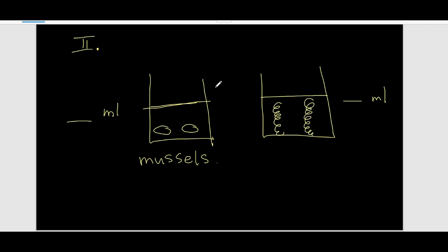Okay. So what we created is an artificial water system. It can be a pond or lake, or it can be a river. We just made an artificial water system. And then what we're going to do is add some pollution to it. Our pollution is soapy water, because soapy water contains phosphate.